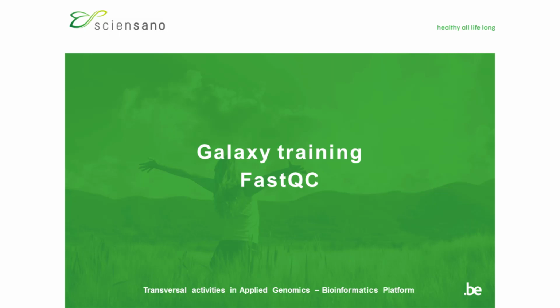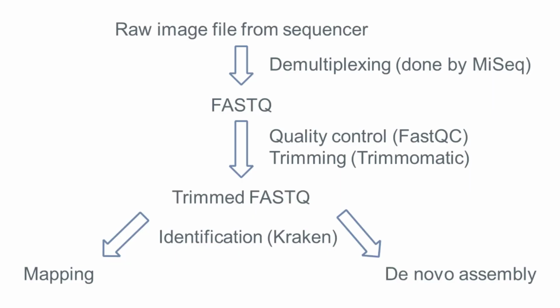In the next couple of videos we will go over a number of tools that can be used to analyze NGS data in order to get you acquainted with using Galaxy to run analyses and the different data forms that are used during these analyses. The tools that will be used all come from this workflow.